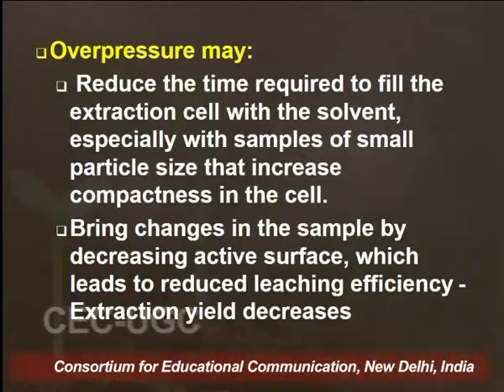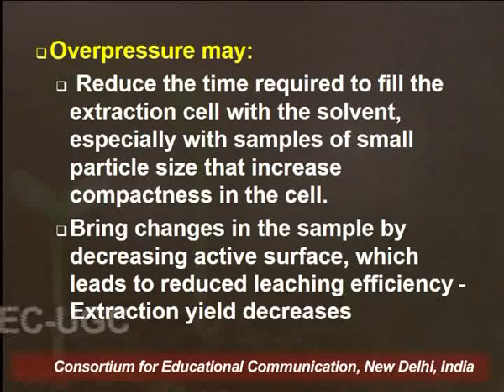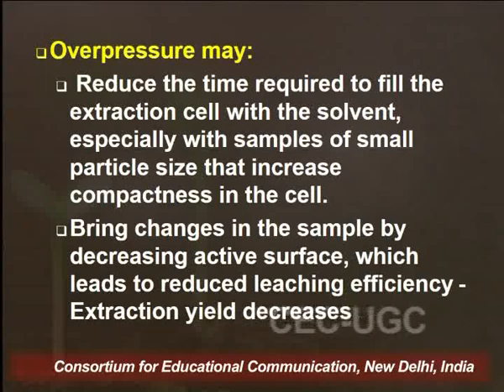Further, overpressure has also been found to reduce the time required to fill the extraction cell with the solvent or with the sample, because we are filling up the extraction cell with solvent or sample, and we have to achieve a uniform filling of the extraction cell. So this increase in pressure also helps in reducing the time to achieve that goal.